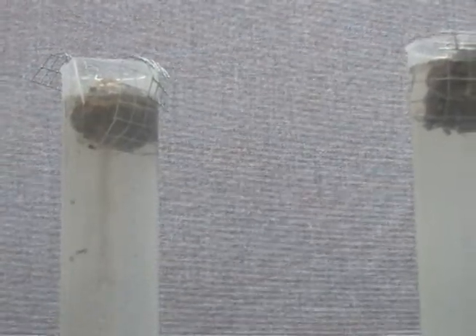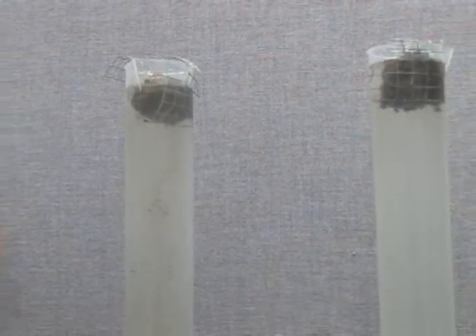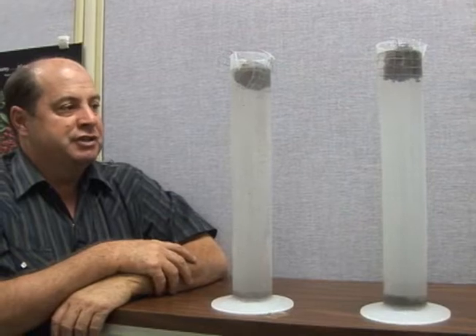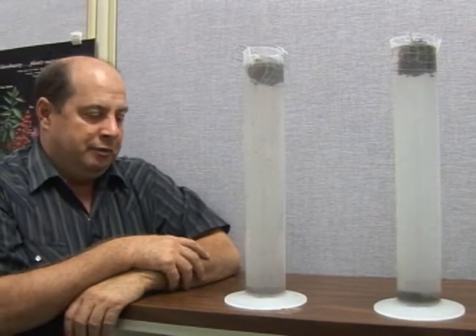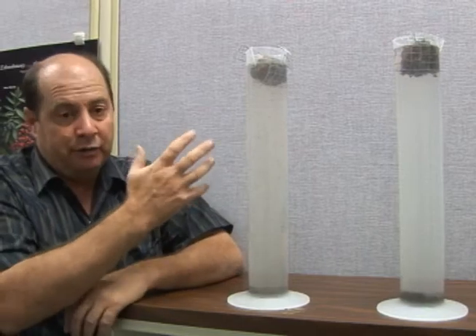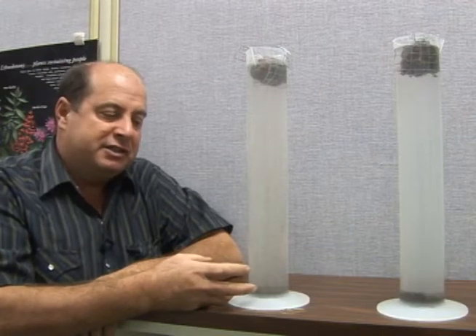Almost immediately it starts to explode. The water is rushing into the air pores and there's just not much structure holding this soil together. There are basically no aggregates — it's just powdered soil and it falls apart.